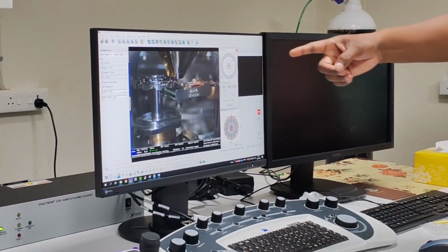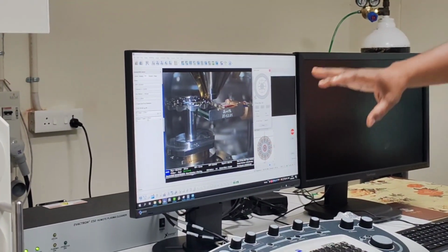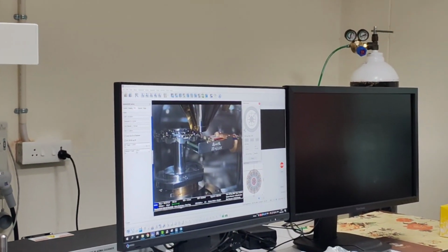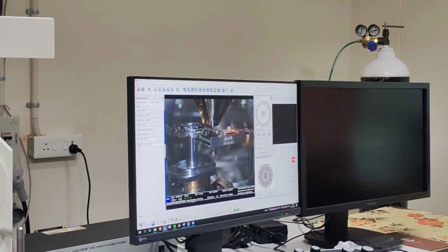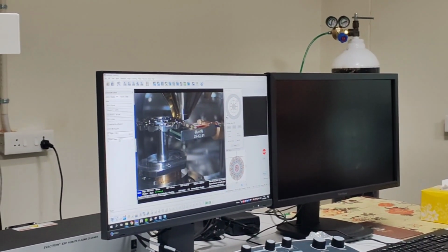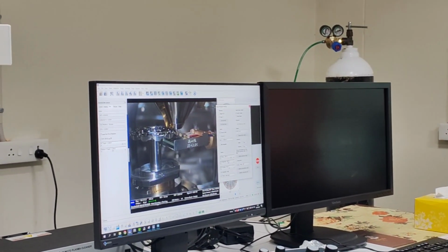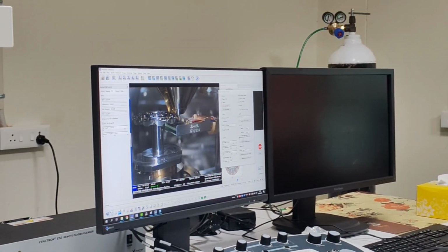Similarly here also, our sample holder will go plus or minus 60 degrees. This is not the sample holder. There is an advanced sample holder where you can pick up the complete plus or minus 60 degree information, and then using Atlas advanced software, you can stitch it and get the complete 3D volume also. So that's all, normally, in the STEM imaging we do.